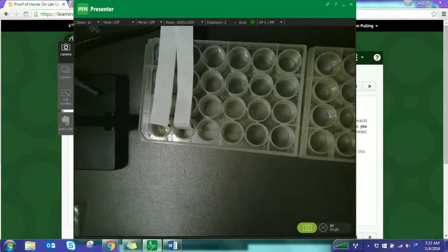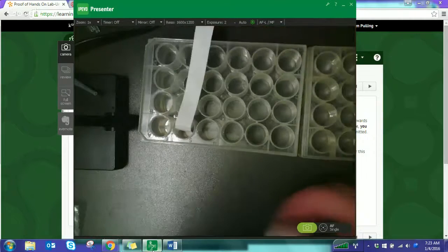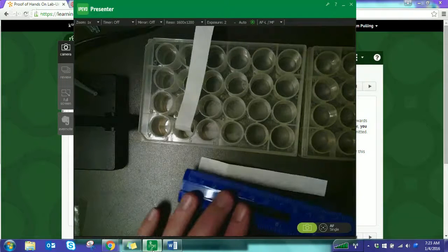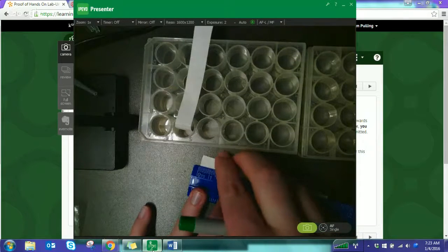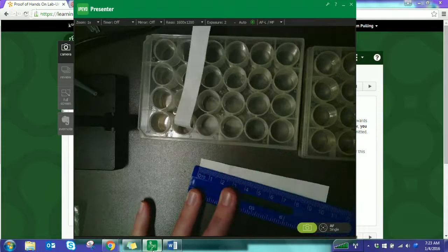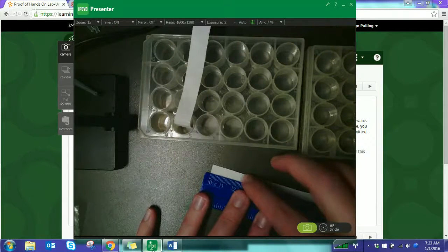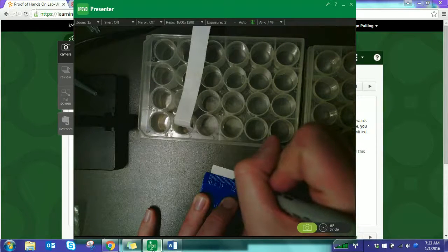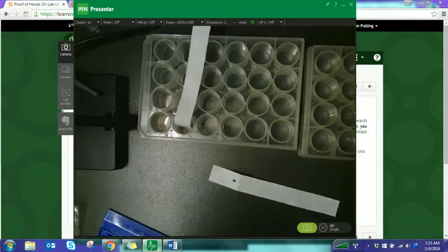All right, so I'm not going to walk you through this entire setup just because I feel like that would be really boring and not exactly the best use of your time. But your next step will be adding your markings. They should fall underneath the fold, so if they don't, you might have to readjust your fold. But remember, 4 of each color, and you're going to keep those colors together. There's one green one, and then I would do 3 more green ones, and then I would do 4 red ones, and 4 black ones.